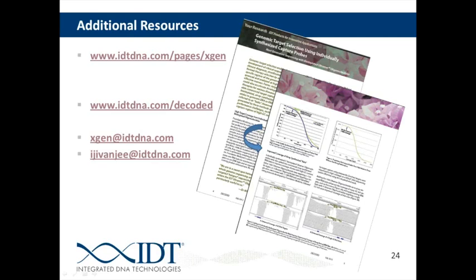Okay. Ibrahim, I believe this is a piece of data that you have. It's something you've commented on before. In combining different panels, if you're supplementing something with the xGen Lockdown probes, what concentration of the probes do we recommend? There's various answers for that. We have one customer that would start with 13 picomoles and take a fraction of their supplement size versus their overall capture size, and that is the amount of material that they use to spike in.